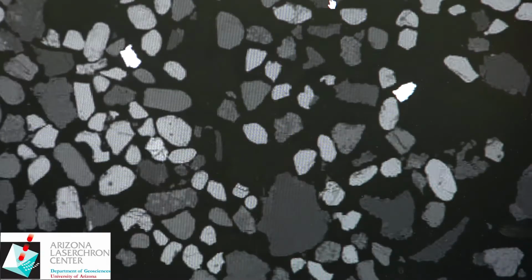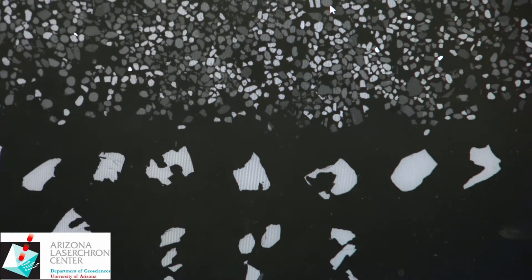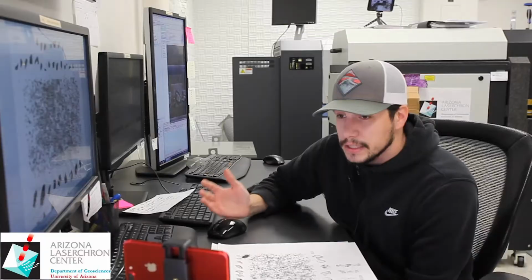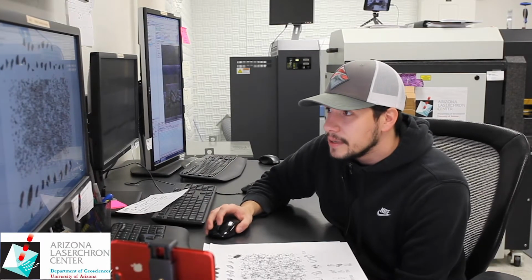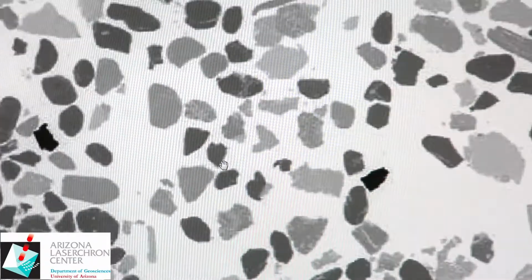on zircon or not. What we do print off for you, since this one has a lot of black in it, to save on ink and then to save on printing quality, we invert this image to give you a black and white. So just to show you really quickly what this black and white image looks like compared to that dark one, here is the inverted version of that last image. If we zoom into that same area, everything basically holds true to what I said, but inverted.